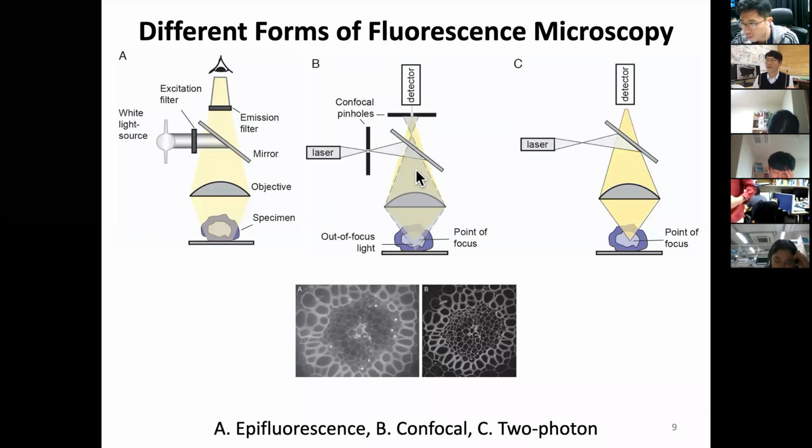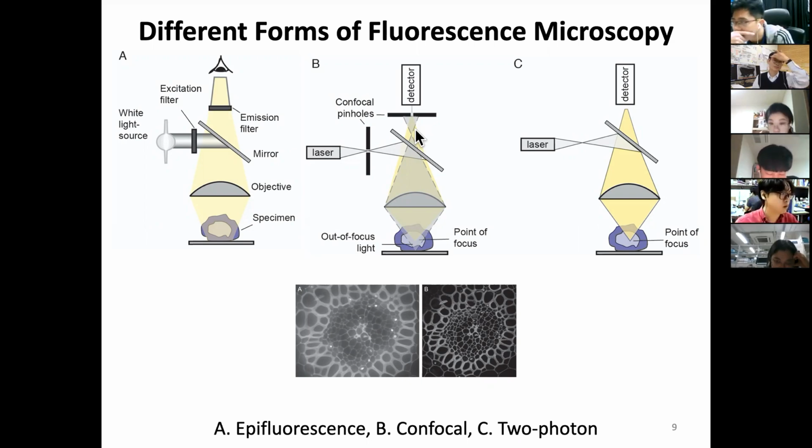Now we invented another type of microscope in 1991, called the nonlinear microscope. So far, all of these we call linear. Linear means if the input becomes twice, the output becomes twice, linearly proportional. But we use photons more wisely to make a two-photon nonlinear microscope.